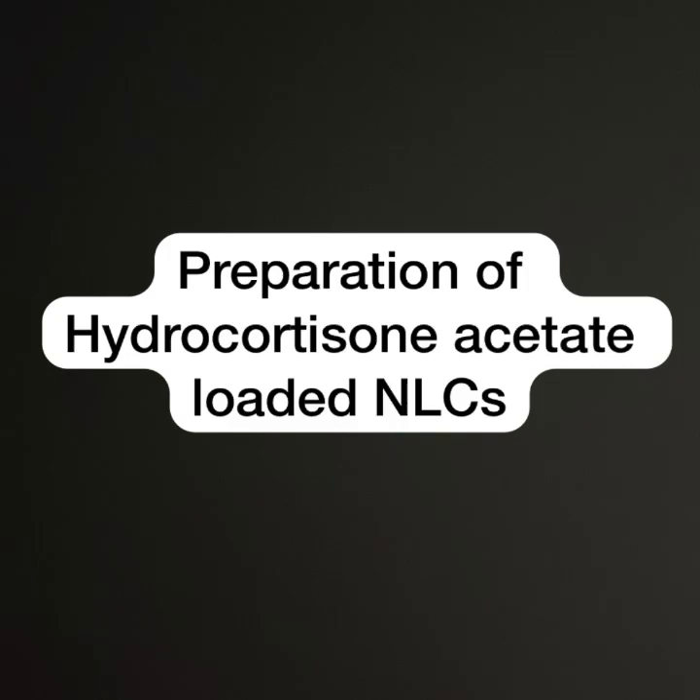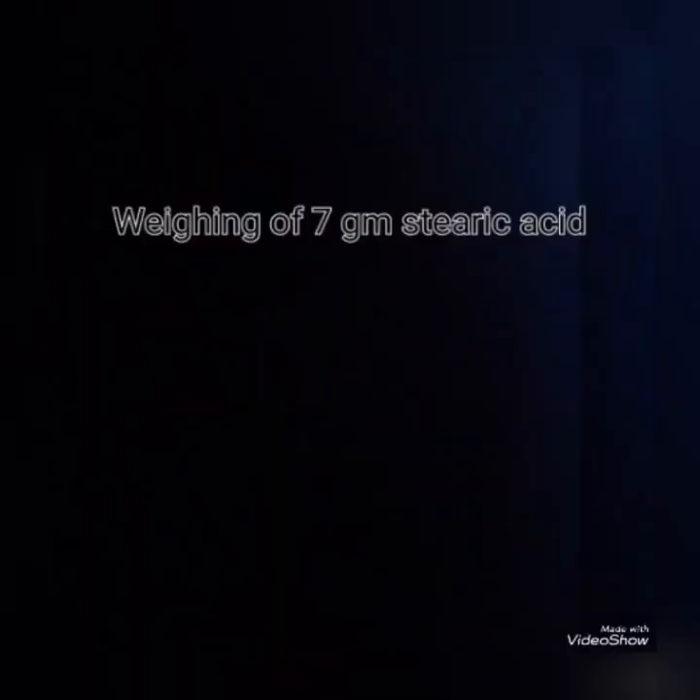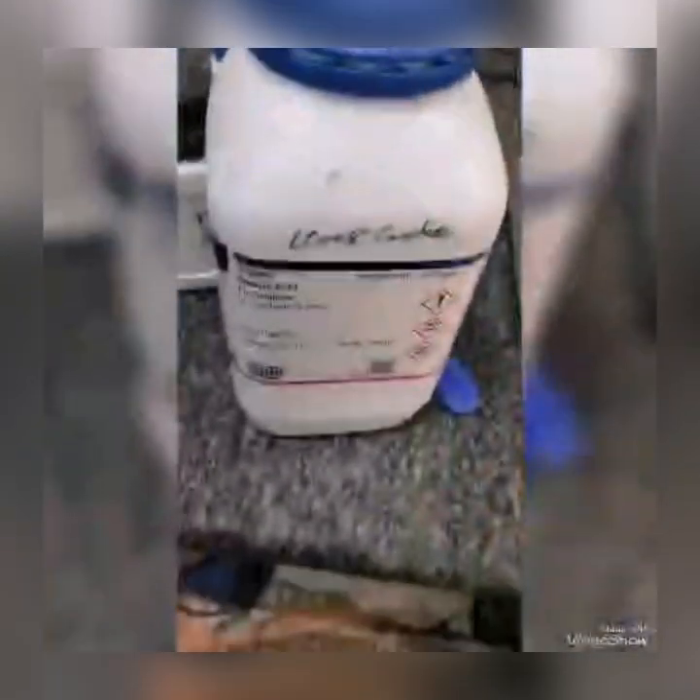To prepare a hydrocortisone acetate-loaded NLC, the microemulsion method was used with some modifications. In this method, the NLC was prepared in a ratio of 7:3. The first step of the NLC preparation is weighing of 7 grams of stearic acid and 3 ml of castor oil.